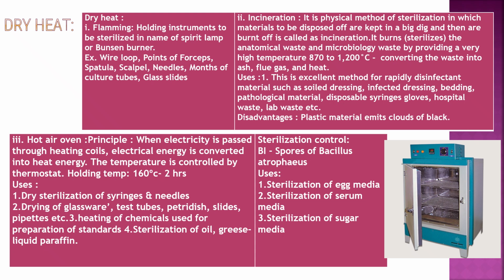Sterilization control of the hot air oven: biological indicator, the spores of Bacillus atrophaeus. The uses of hot air oven: sterilization of egg media, sterilization of serum media, sterilization of sugar media.